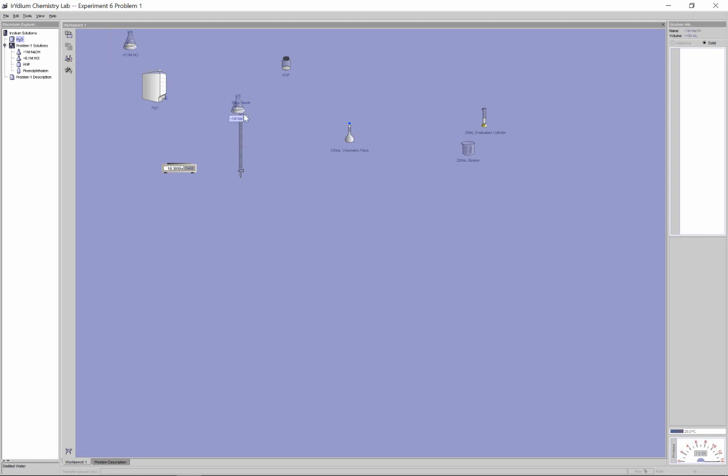So take this Erlenmeyer here. You can use a funnel if you feel safer with it. Again, in total, it would be about 50. Let's transfer in, let's say 40. Again, there's that transfer bar at the bottom here with the 40. I press enter. It even zooms in for you here.